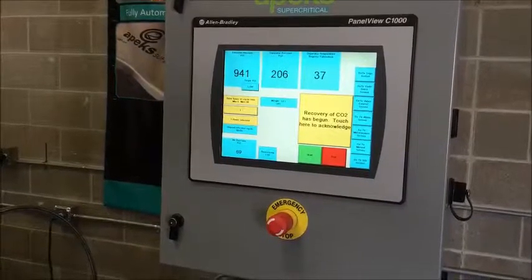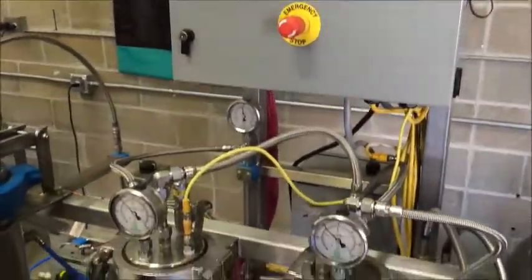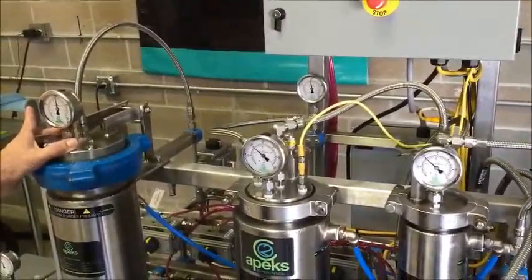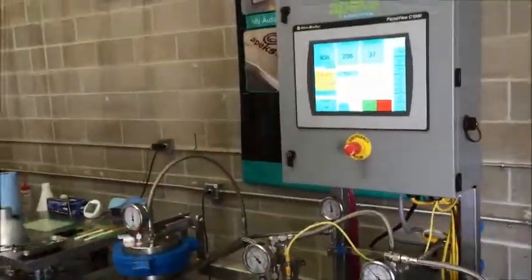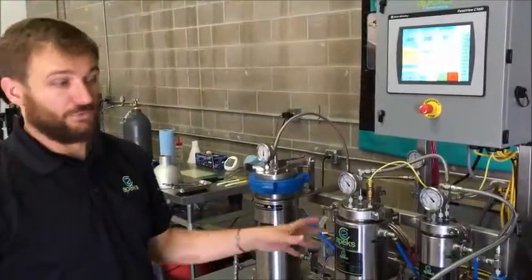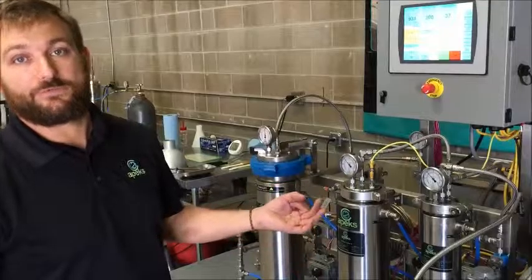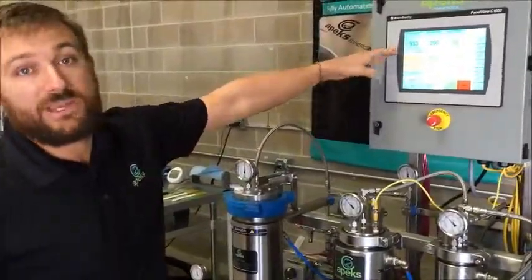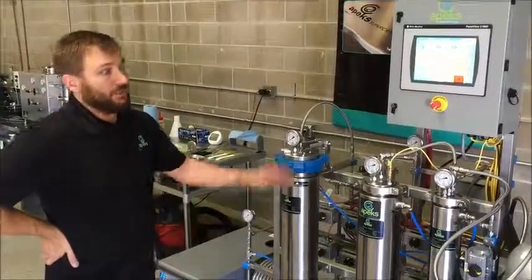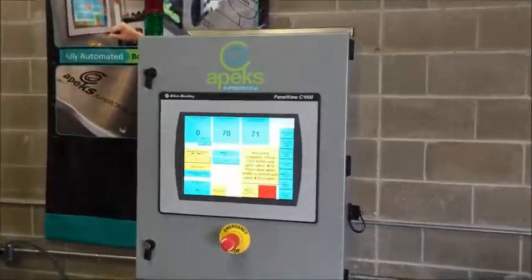Now our system hit its hour mark and went into recovery. A message box came up saying 'recovery of CO2 has begun — touch here to acknowledge.' Even if you're not here, you don't need to touch it, but if you are, go ahead. What's happening is it's pulling down CO2 and slowly putting everything back into the bottles. The CO2 recovery process takes up to 30 minutes because we don't want to take our liquid CO2 out of the extraction vessel and send it straight to the bottles — there could potentially still be oil in that liquid CO2. So we run all that liquid through our separators, turn it back to a gas, make sure the oil falls out, and send that gas back to the bottles. Once it gets down to 600 PSI, we know it's a gas and then things go really fast.